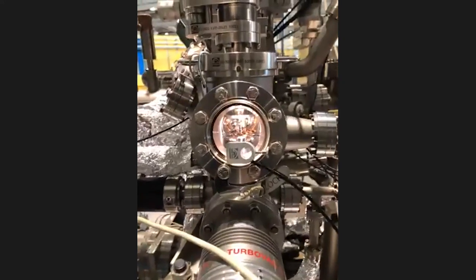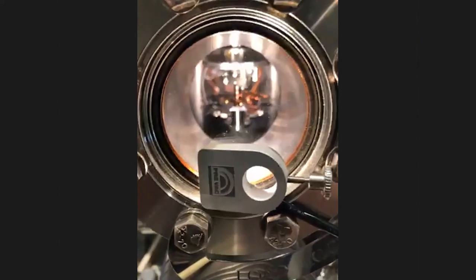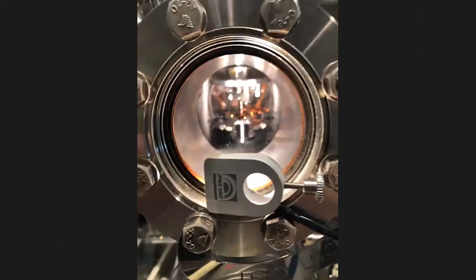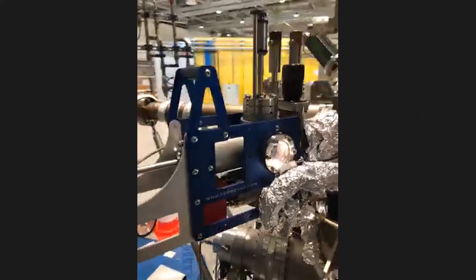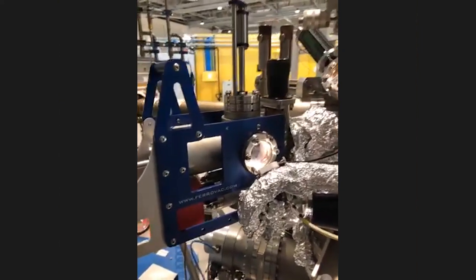It is an introduction chamber, and we use it to introduce a sample to our vacuum environment. This chamber is usually called a load lock. On the left-hand side, you can see a vacuum suitcase, which is used to move samples from one vacuum chamber to other vacuum systems.